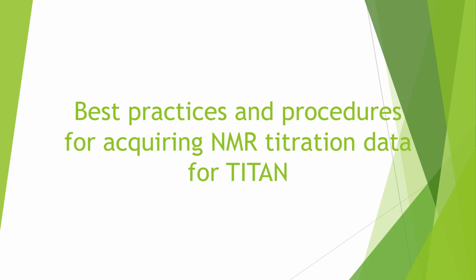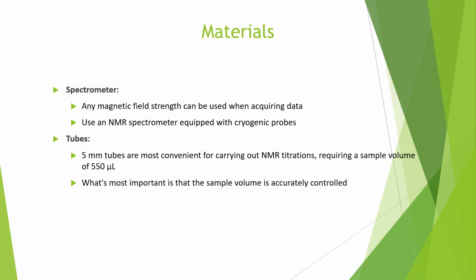This video will be discussing some of the best practices and procedures to ensure you acquire the best NMR titration data possible for analysis in Titan. This will be a short video, where you can find more information will be discussed at the end of the video. Field strength can be used when acquiring data.